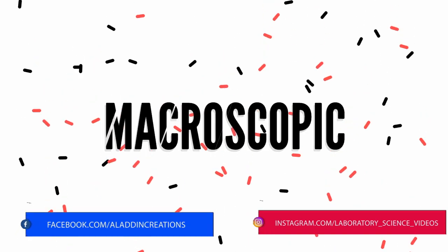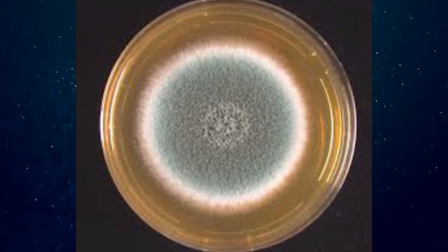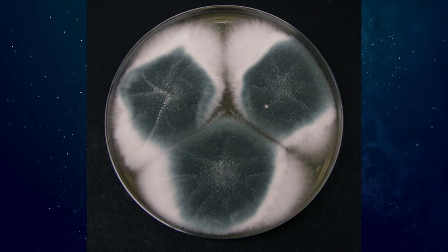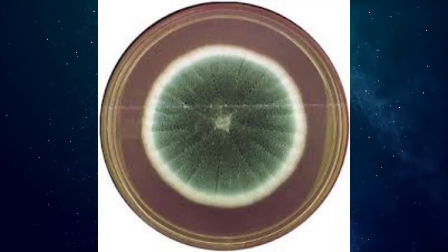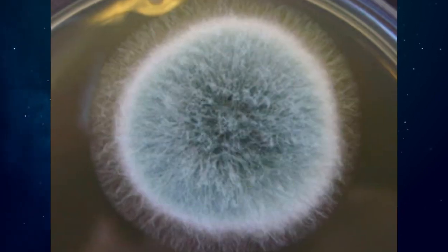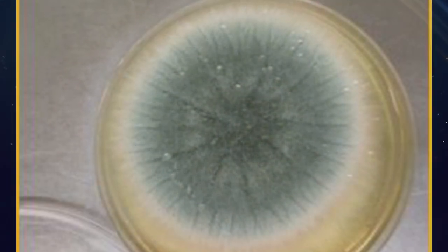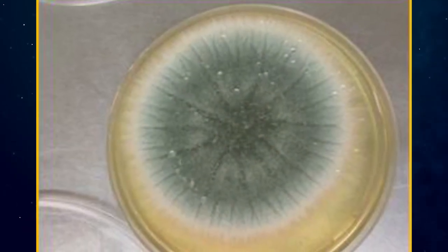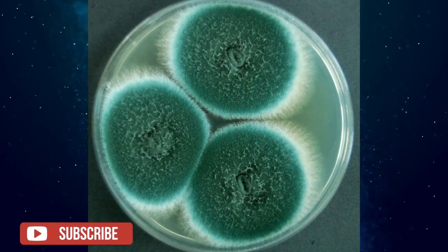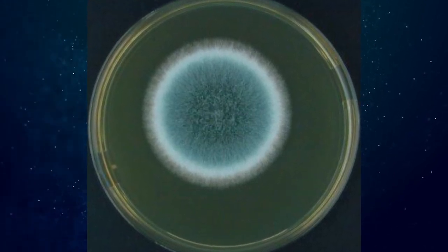Macroscopic characteristics. The culture is velvety or powdery, at first white, then turning to blue-green color, with a narrow white border. Reverse white to tan. Aspergillus fumigatus is a fast grower. The colony size can reach up to 4 cm within a week.